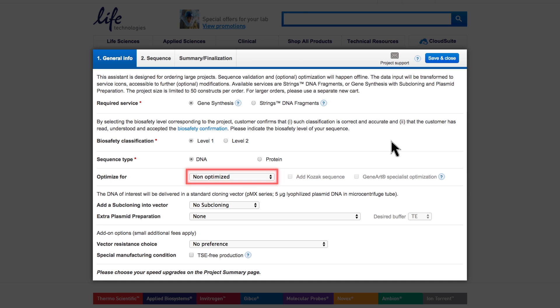Open the list here to choose from. Please note that expression in some hosts requires a Kozak sequence. This will be indicated by an activated checkbox that you should then click.